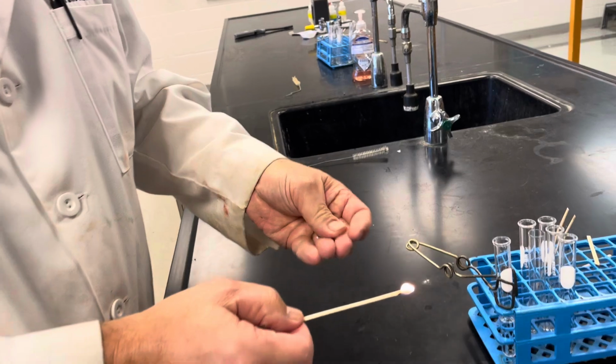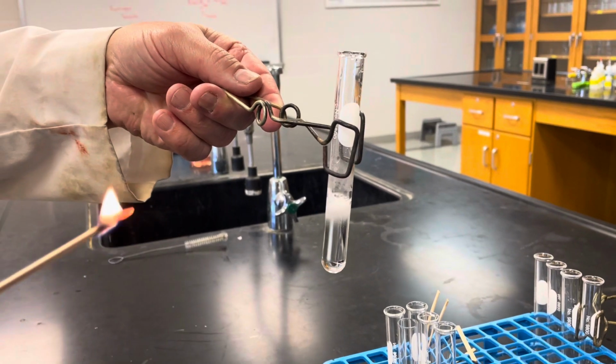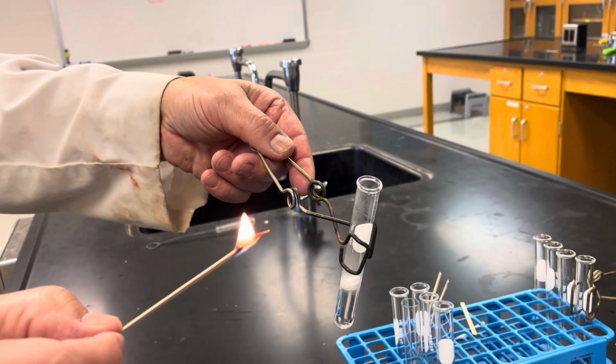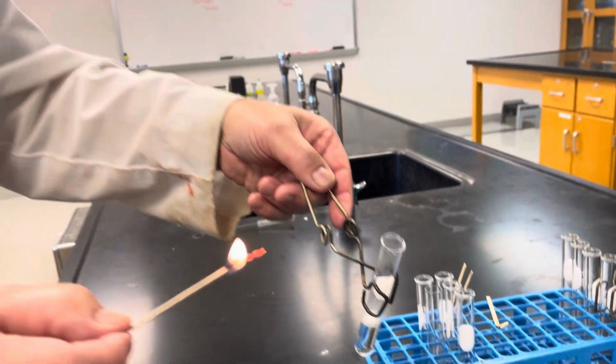Now I'm going to just drop this in, and we immediately see that it's bubbling and fizzing. And when I put the wooden splint over the mouth, I don't know if you could see that, but there was a fire that came up out of the mouth of this. Let's see if we can get it to go again. Oh, there was a little bit of a pop right there.